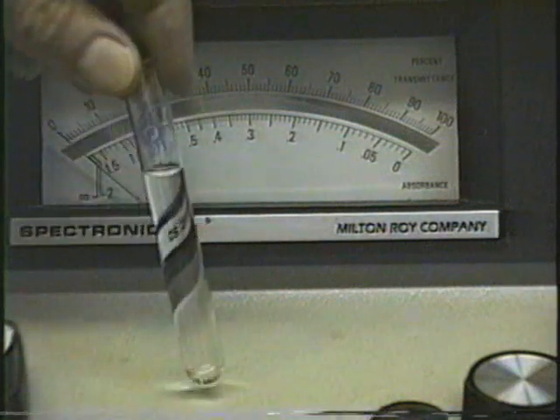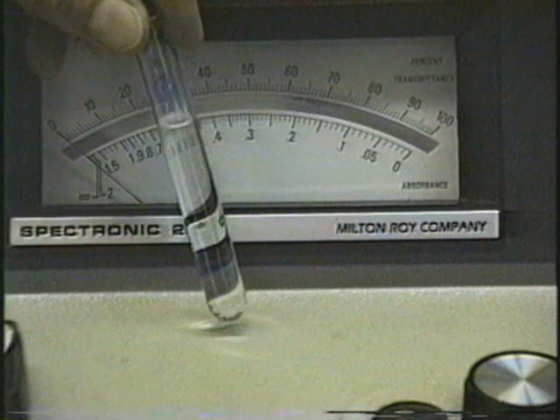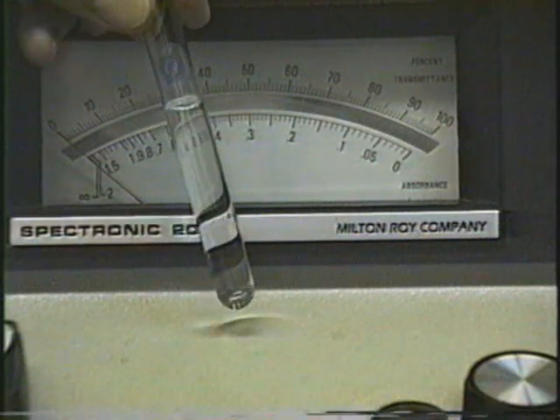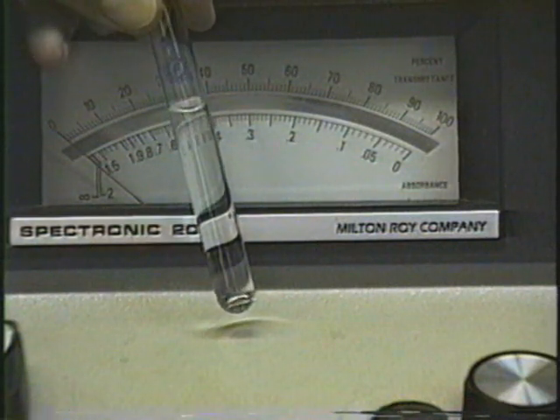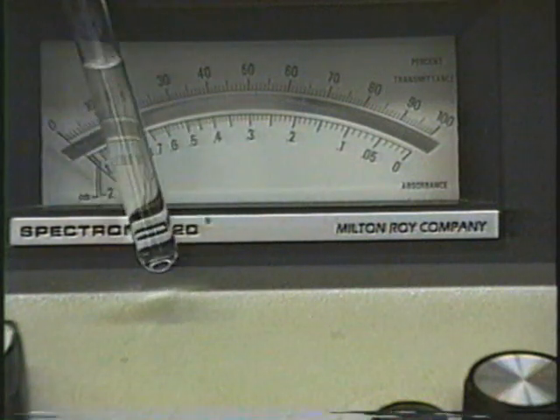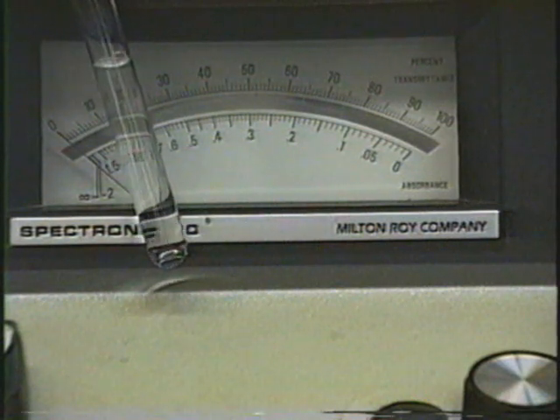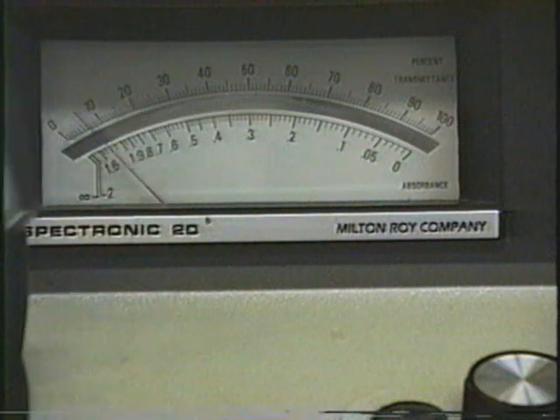Now we will put in our cuvette, the one that you're going to be using, not the reference. This is your regular cuvette. It's going to have nothing but distilled water. This is called the blank. We'll see what your cuvette reads with distilled water in it. The machine's cuvette reads 100%. You use it to set the machine. Your cuvette may read something different.